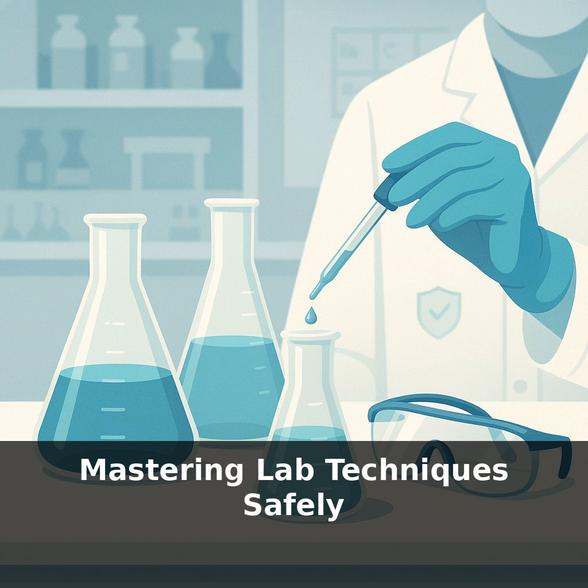Is the fume hood's airflow in range? Are the correct gloves stocked? Are incompatible wastes separated? When these habits become routine, the hissing burner is just background, not a looming threat. In real labs, safety decisions are rarely dramatic. They're dozens of small choices made in seconds.